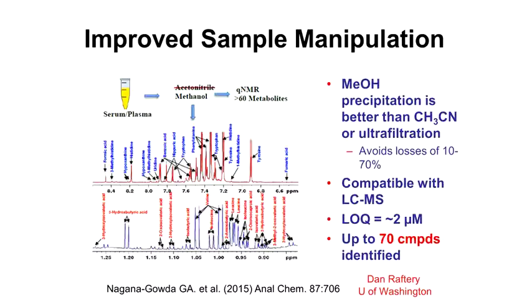What's more, the methanol precipitation is much more suited to high throughput work. You can take 100 samples, put so many drops of methanol in every sample, spin them down, and then there is a freeze-drying step, but you can freeze-dry 100 samples simultaneously pretty easily. It's hard to spin down 100 samples with a single microfuge. So a number of groups are starting to adopt this.